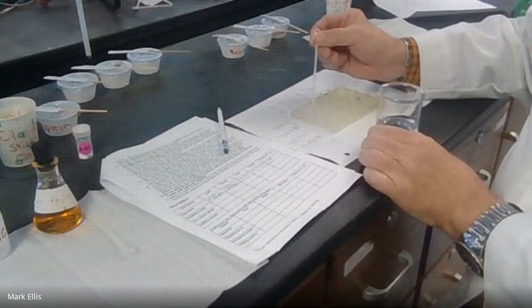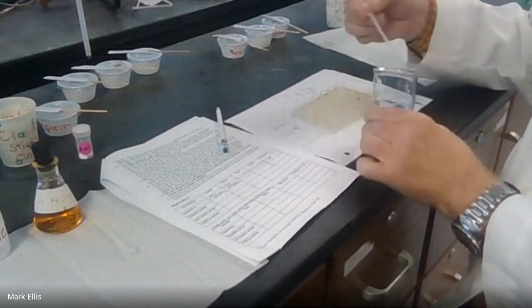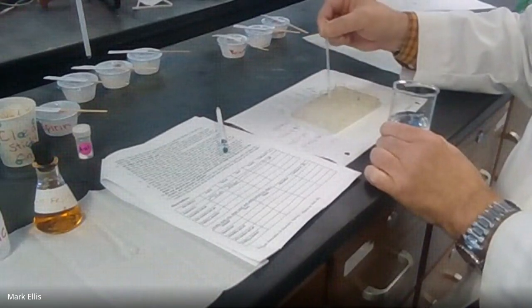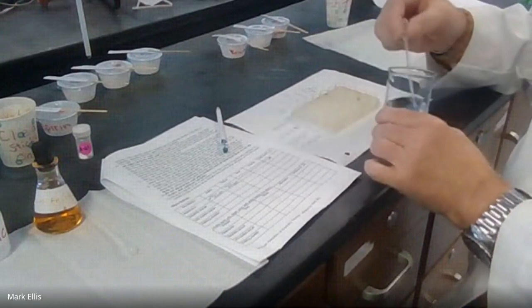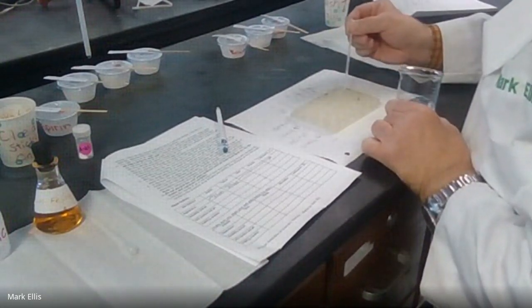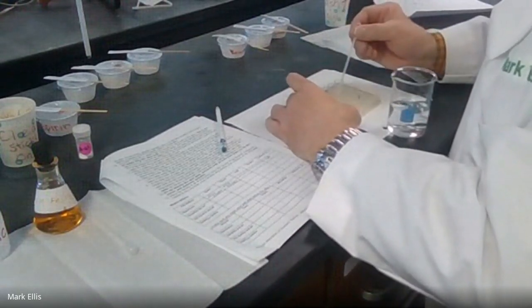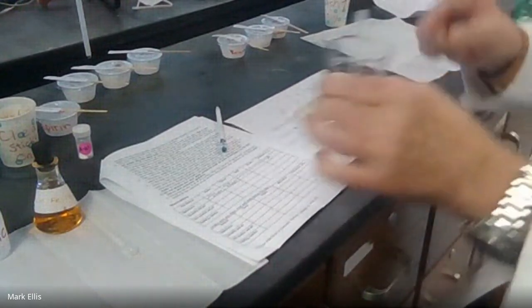1, 2, 3, 4, 5. Good enough. 1, 2, 3, 4, 5. A little bit more. And lastly, 1, 2, 3, 4, 5. Did I get one in that one? No, I missed one. 1, 2, 3, 4, 5. Okay, done with the water. Put the dropper back in and put it where it belongs.